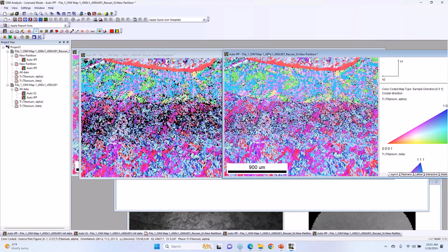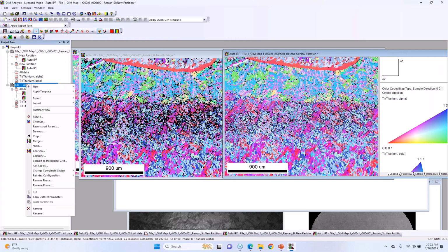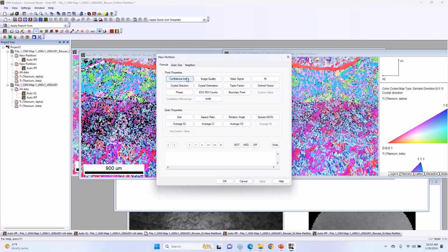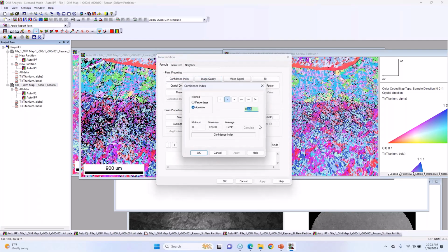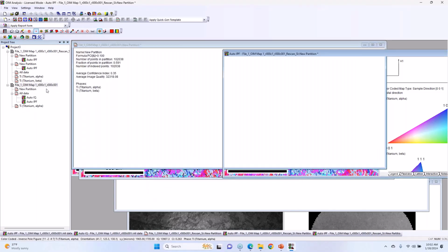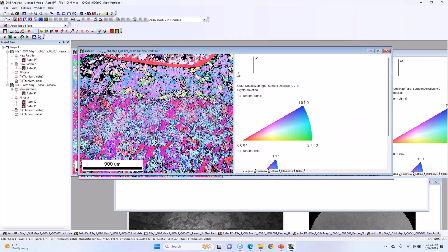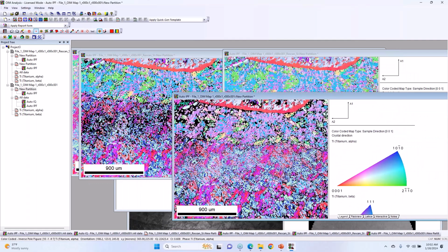That goes back to your step size type of performance, but you can see it does a really nice job re-indexing, versus if we looked at our initial data with a confidence index of 0.1 again. Here it's down at the 60, and we'll do the standardization. Here you can see that area through here, it improves.